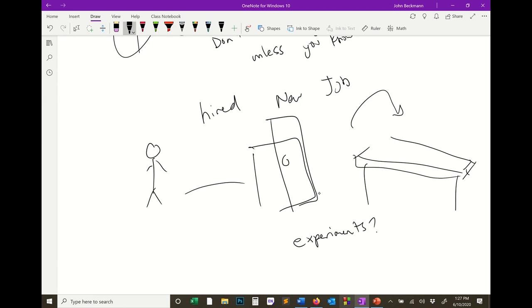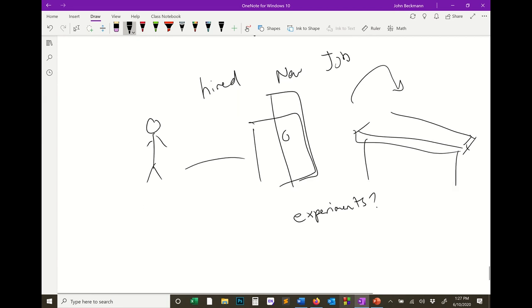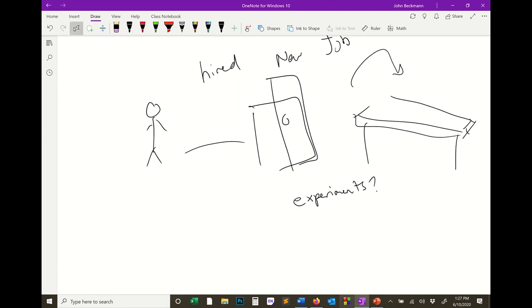What should you do on your first day? What should you do in this new environment? You're going to be terrified. You're going to be afraid. You're not going to know what to do. There's two things you should do on that first day. And I tell you this just to make your first day a little bit easier. The first thing you should do is use this lecture to start making solutions.